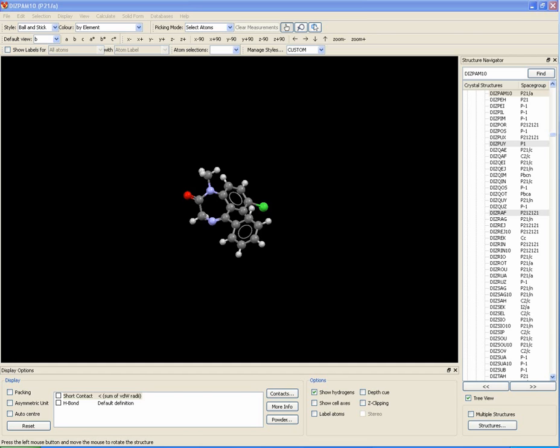Space group settings. This particular example is the crystal structure of an anticonvulsant drug, diazepam.